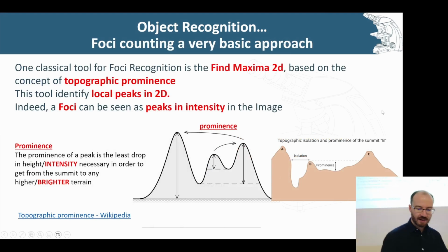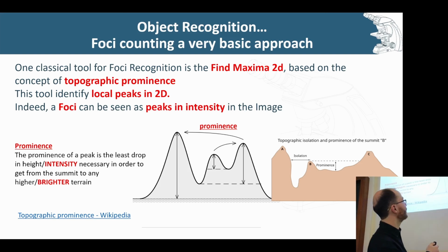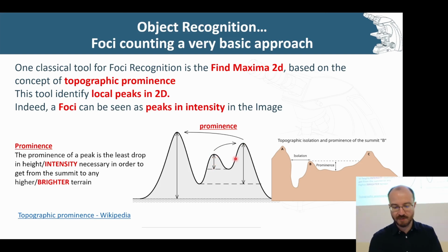The principle under which it works is that you define something called a prominence. The prominence is basically, for the closest hill, how big is the difference between it and the next one. So let me get this laser pointer. The prominence from this peak to that one is this height here. You always talk about, from one peak to another peak, what is the prominence difference? The prominence is basically how much it dips down. What is the drop it takes before it goes up again?